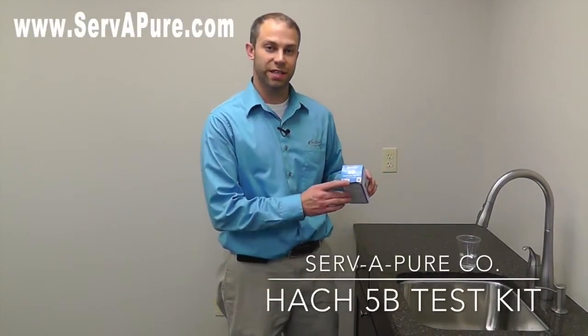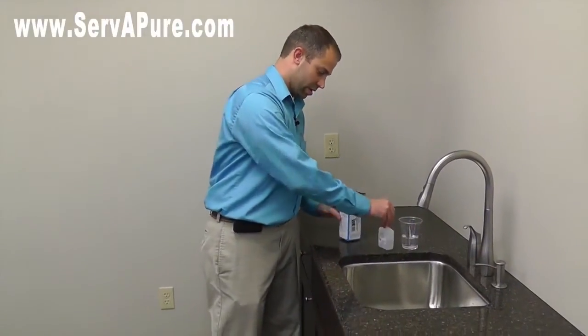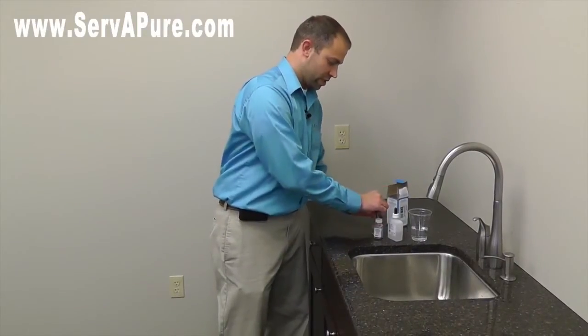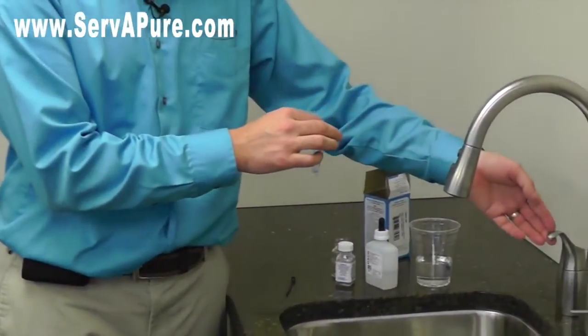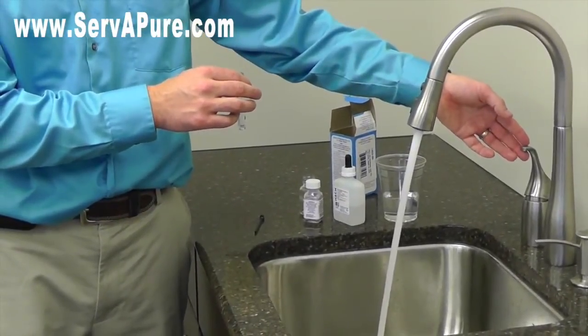I'm John with Servip here and I'm going to show you how to use the Hock 5B Hardness Test Kit. Inside your test kit you're going to have a few items. The first thing you're going to need to use is the little bottle that comes with it. You want to open up your cold faucet, let it run for a little bit, and get a good clean sample.